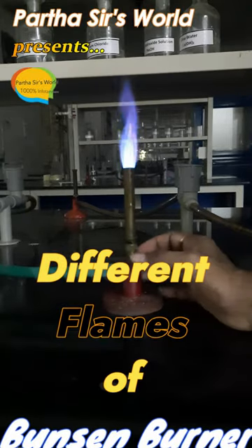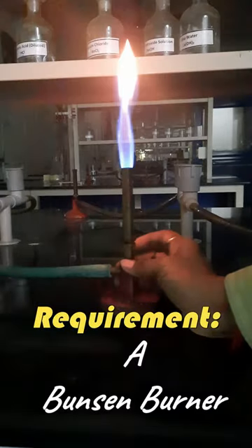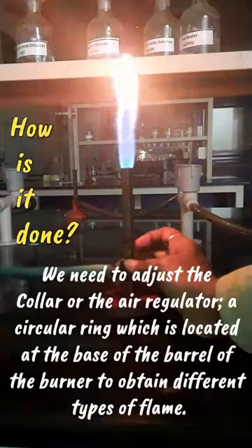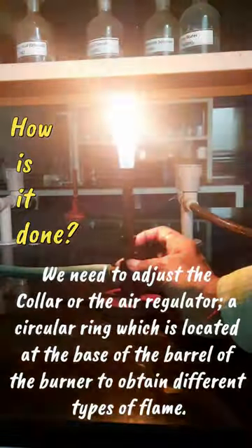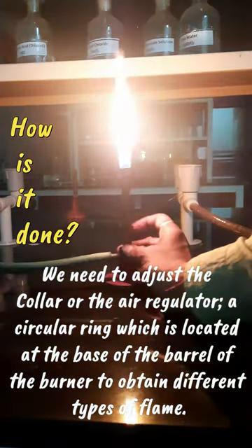Parthu Shor's World presents Different Flames of Bunsen Burner. We need to adjust the collar, or the air regulator — a circular ring located at the base of the barrel of the burner — to obtain different types of flames.